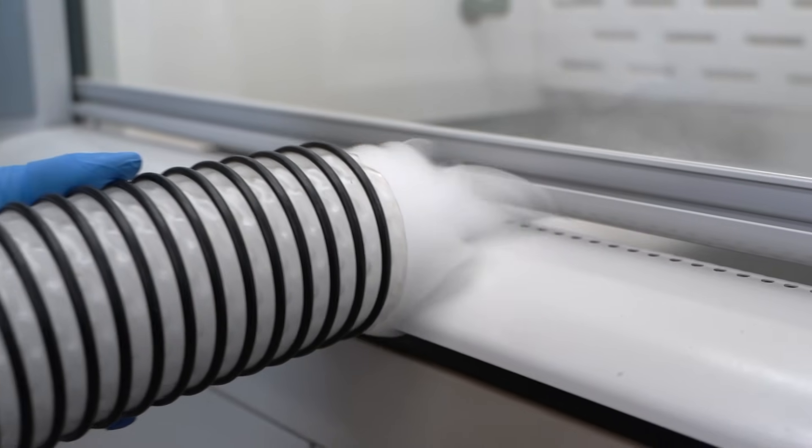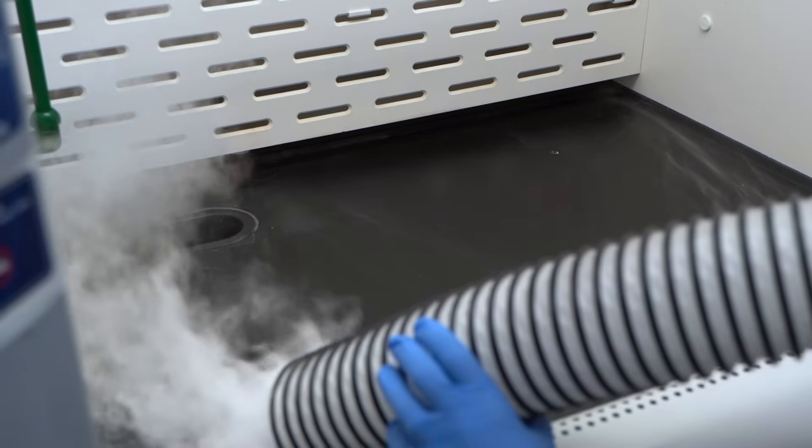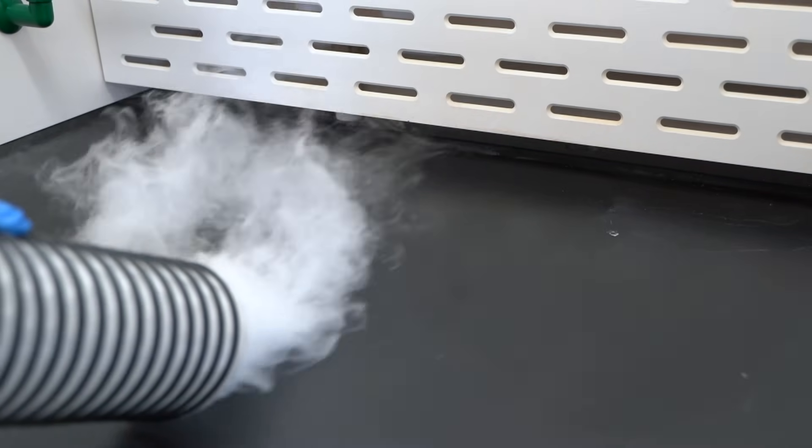On hoods with open slots along the edges of the baffle, fumes generated in the middle of the hood are drawn in from the sides.